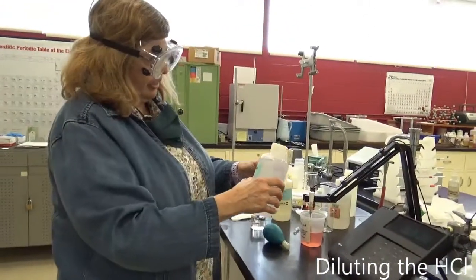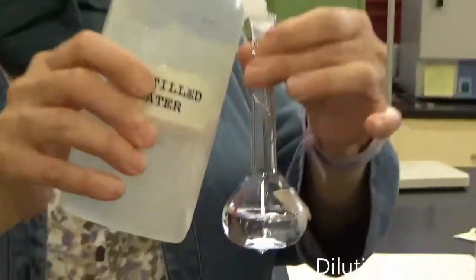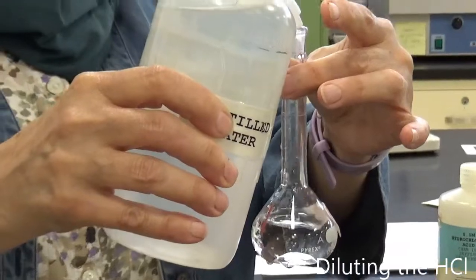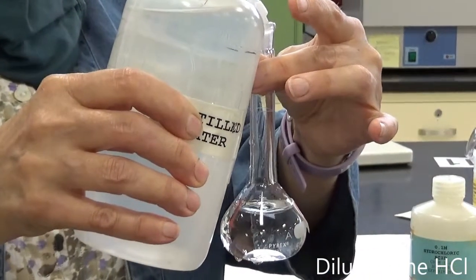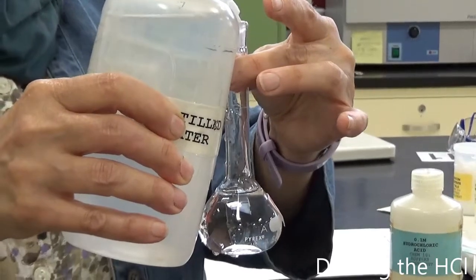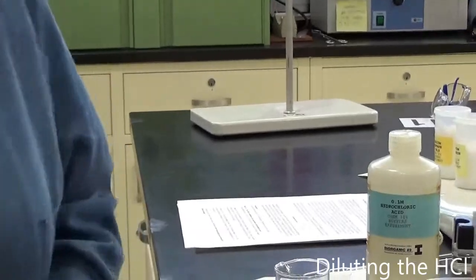And now I'm going to add water. I think I'm going to go get the distilled water bottles that come out much slower so I don't make a mess of it.